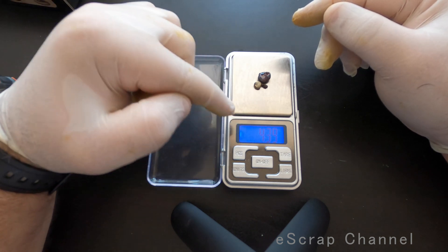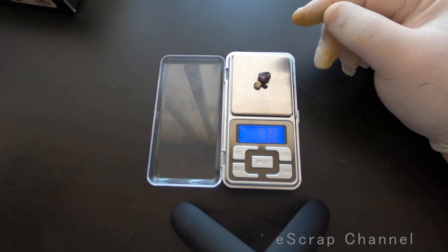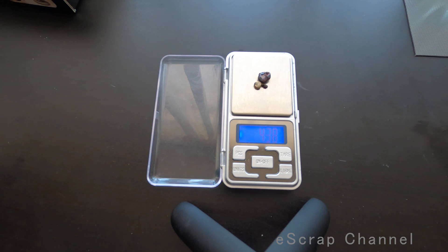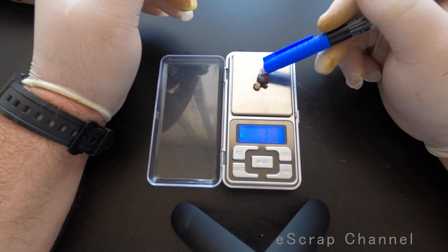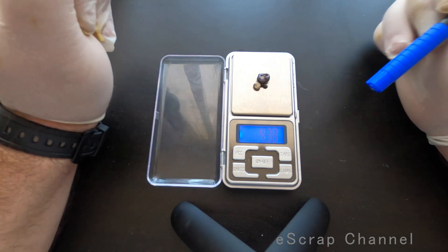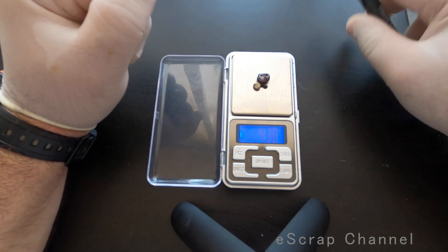So let's put this 4 grams, let's say 4.4 grams. We start with 4.4 grams of trash and let's check what is inside.